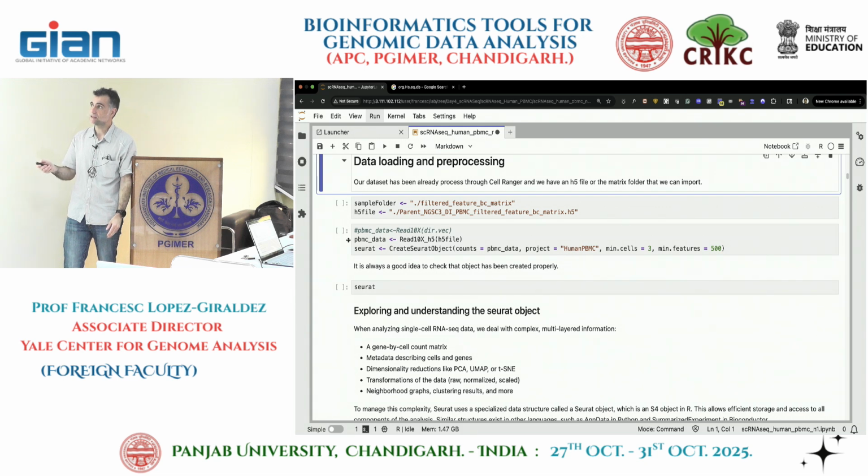I decided at the end not to include it, so as not to create problems or confuse people. It seems I kept the code, but I removed the folder. So this is nothing, don't worry about it. You can remove it or leave it, it doesn't matter. So what I'm doing here is indicating where I have my H5 file. I indicate in what folder it is. It's in the current folder, and it's called like this. And I store it in a variable that I'm going to use later to create this object, which is reading the file. That's the only thing it does.